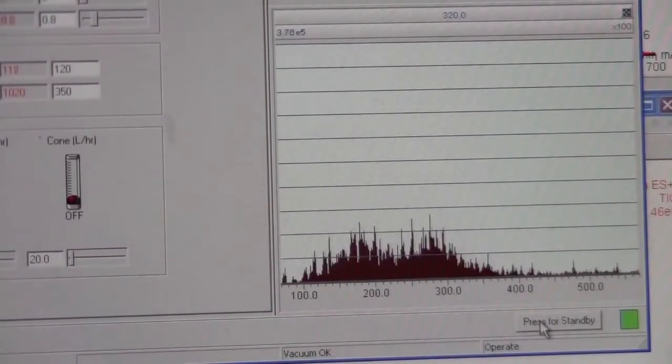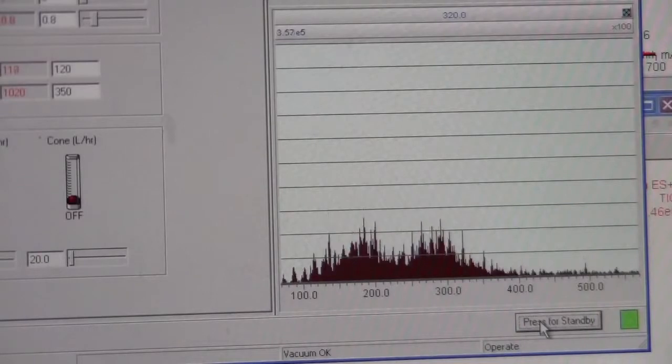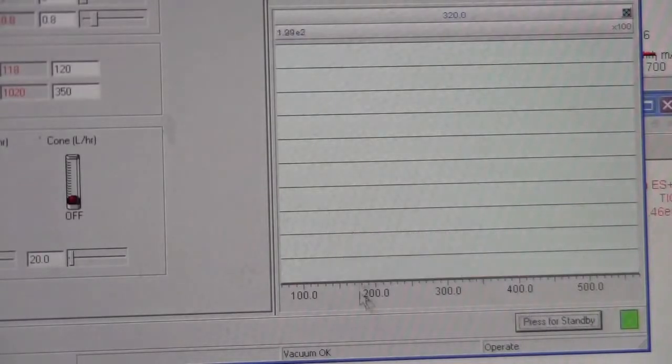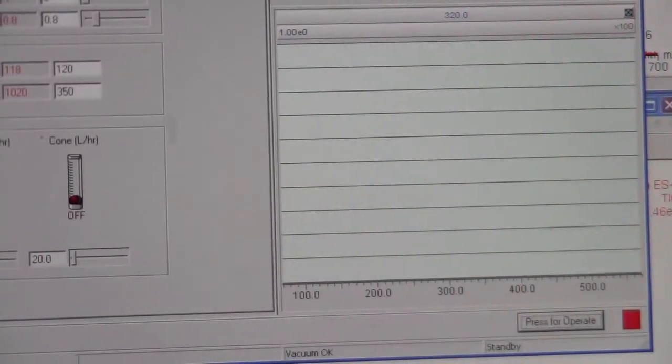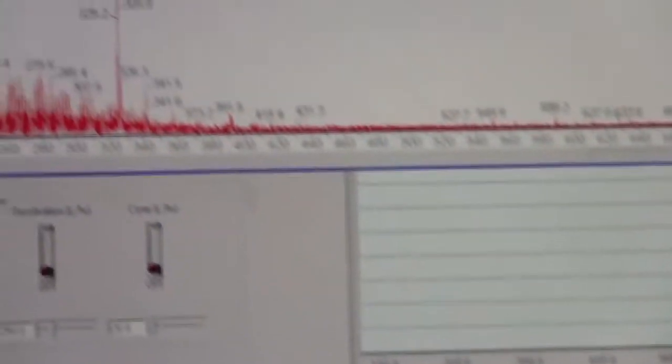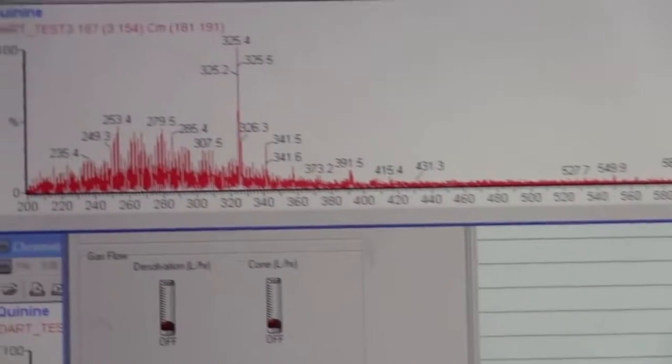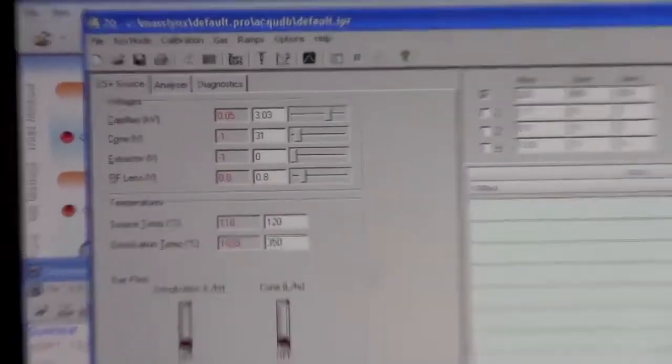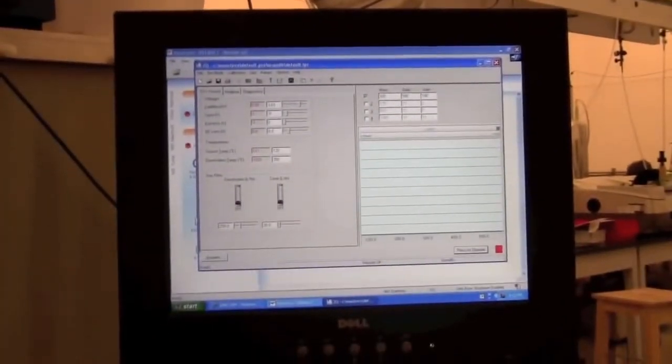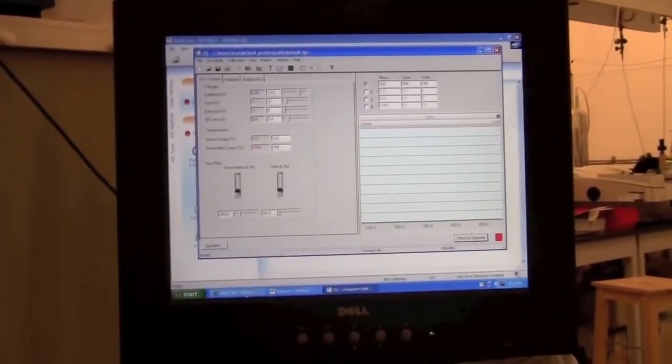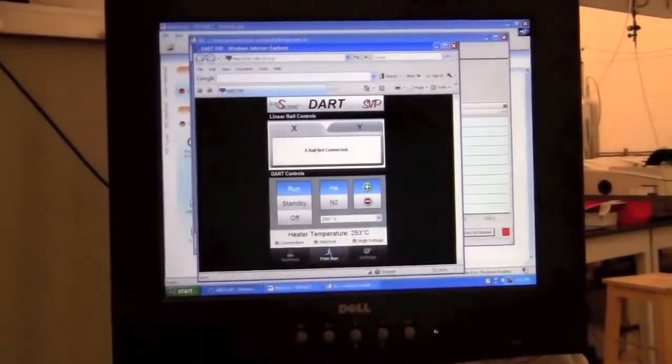If you want, you can put it on standby. It's not necessary, but it's a good idea. You can close the spectrum and the chromatogram pages. And then you can go back to the DART source.